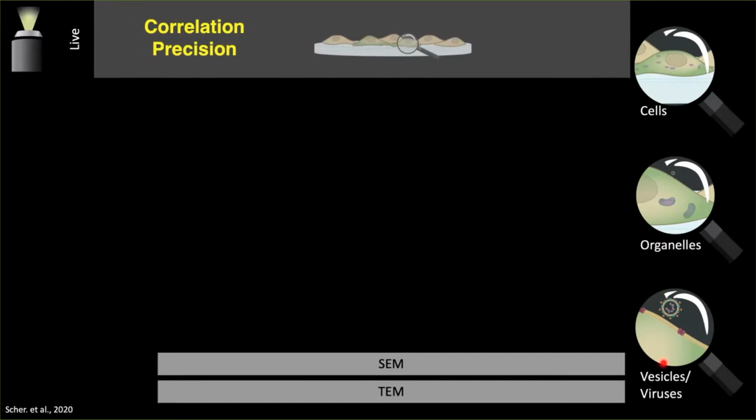So let's take, for example, this idea of looking at endocytosis. If I were to image my cells live, then by the time I've finished imaging the process and wanted to fix them for EM, because I hope at this point we are all on the same page that electron microscopy has no dynamic information. It's all a post-fixation method. In the time that it took the fixative to do its job, whether chemical or cryogenic, your object continued to move. So it's physically no longer necessarily in the position that you imaged it, and therefore your ability to correlate it is diminished.